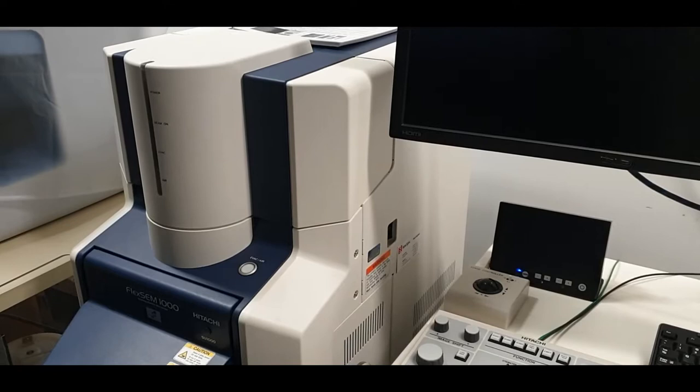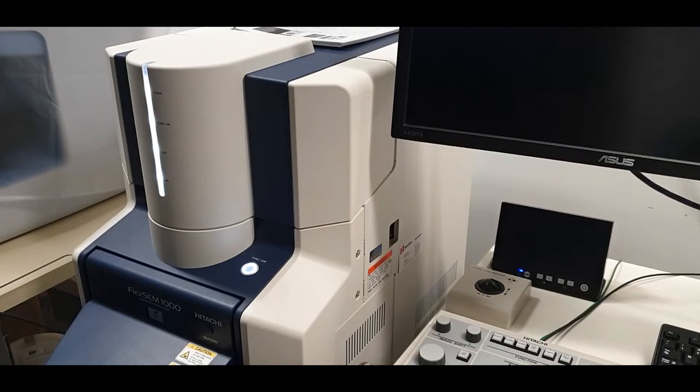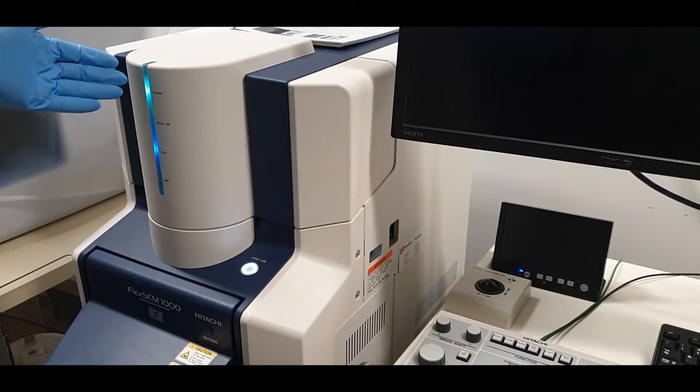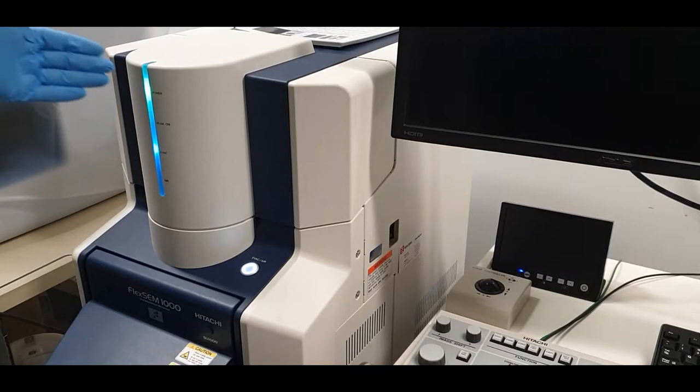Next we need to power up the SEM. Use the switch on the right hand side to power up the instrument. You will hear the rotary pump engage and see lights flashing on the front. Whenever the lights are flashing, it means the instrument is going towards a particular state — in this case, the vacuum state. When the instrument is flashing, it is working.